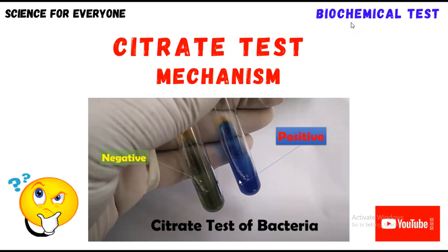Today the topic is related to microbiology, and the title of my lecture is the citrate test and its mechanism. Basically, it's a biochemical test used to differentiate between microorganisms, those that are citrate positive. They consist of a special type of enzyme known as citrate permease, and they can utilize citrate as their sole carbon source. A microorganism that cannot utilize citrate lacks that enzyme. To detect that enzyme, we use this biochemical test.